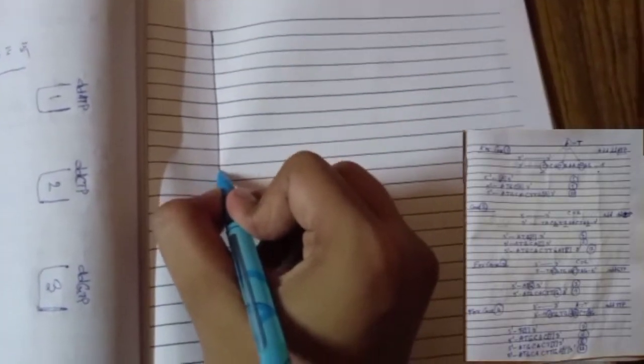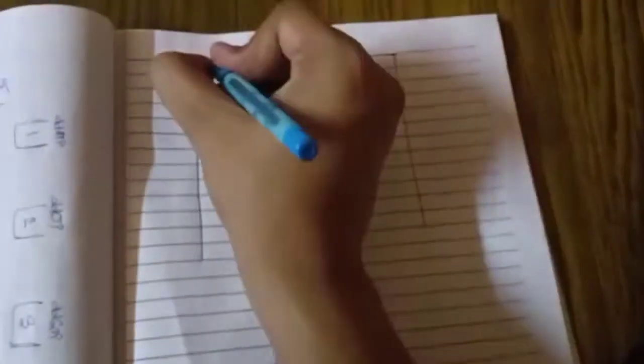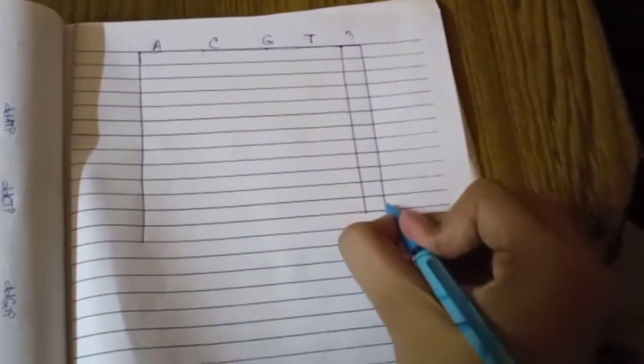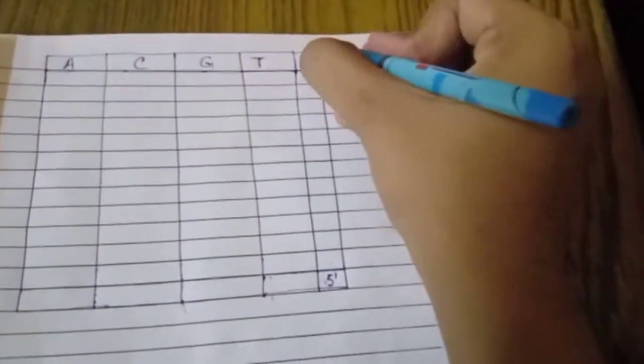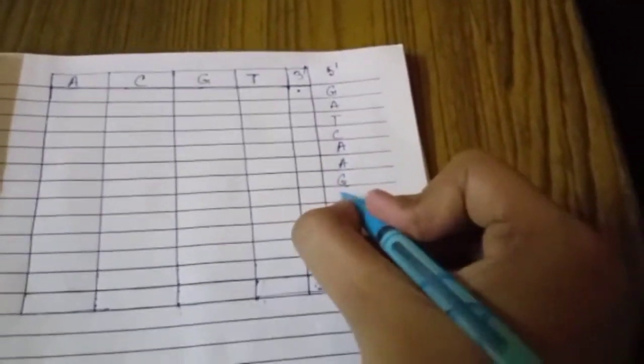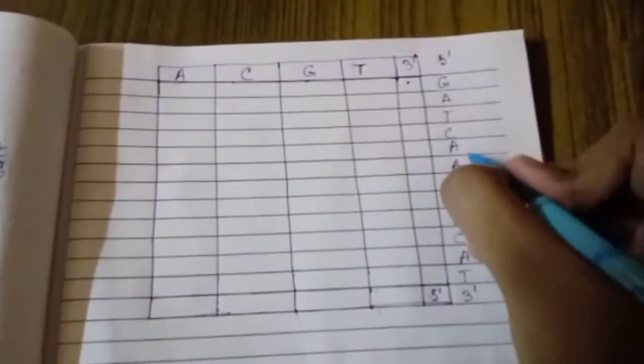And from here we get the strand which we want to sequence. Please notice carefully. Now I am writing the original DNA strand, which was 5'GATCAAAGTGCAT 3', and this is the original template.